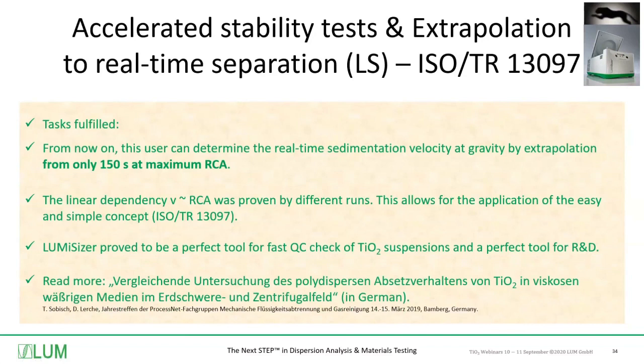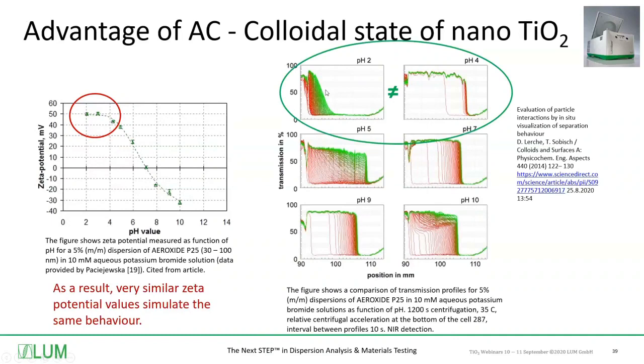There are several publications in this context. I would like only to recommend one of my colleagues, on pH 2 and pH 4 transmission profiles. We can see by naked eye it's absolutely not very similar. It's not similar at all.